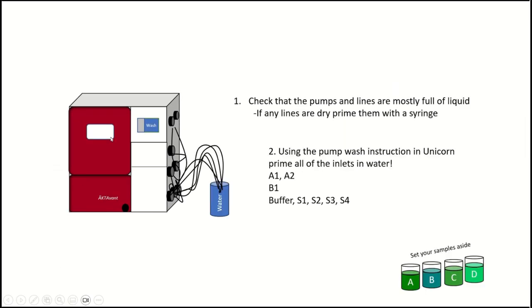Okay, so the first thing you're going to do is check that the pumps and all the inlet lines are mostly full of liquid. If any of the lines are completely dry, you need to prime them with a syringe. Then you're going to put all the lines you're using into water and prime them with the pump wash instruction. This is going to be A1, A2, B1, the sample pump buffer line, then S1 through 4.